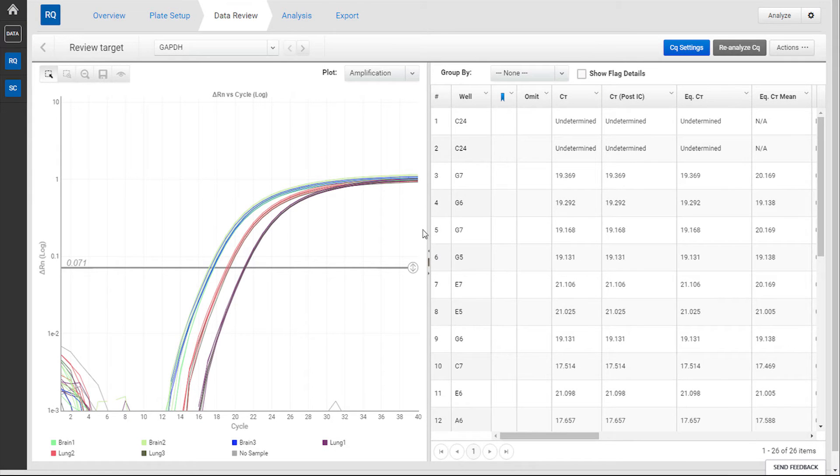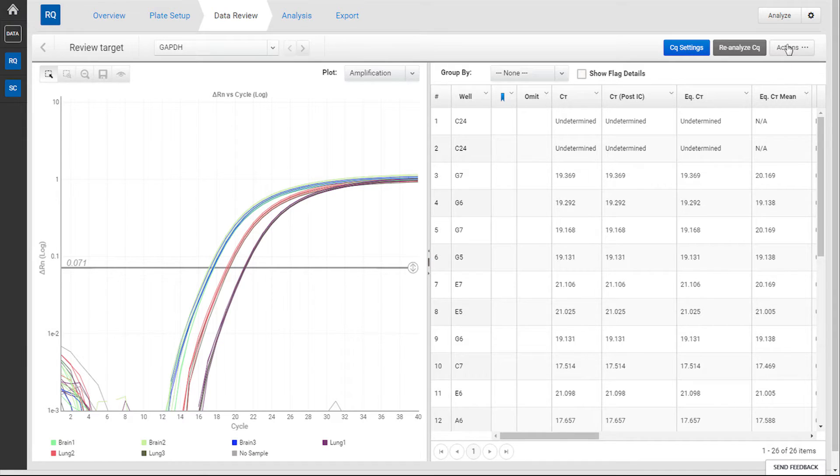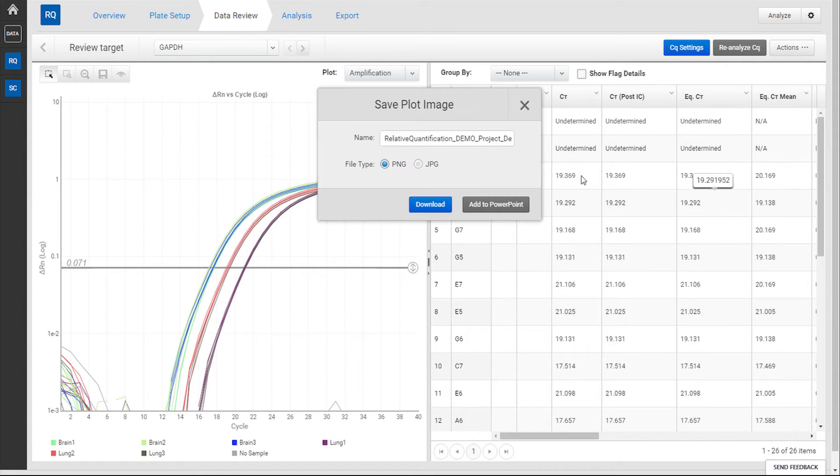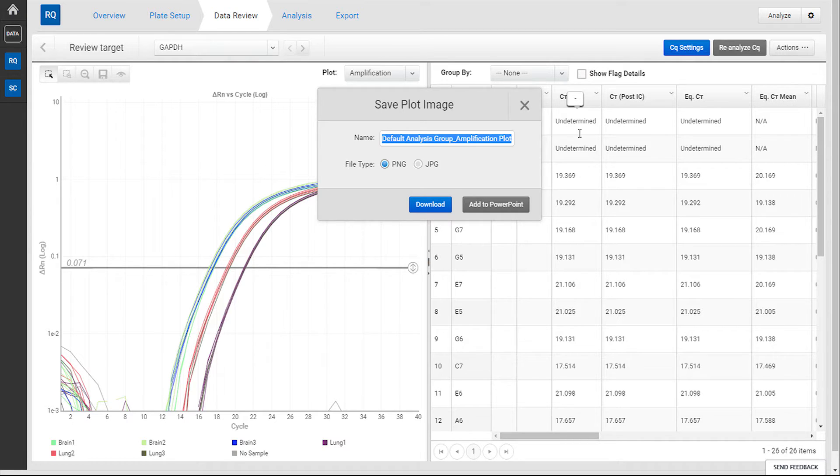For any graphic within the Relative Quantification application, you can find the Save Plot Image function under the Actions menu. To tag this image for a PowerPoint export, assign it a name and then click Add to PowerPoint.